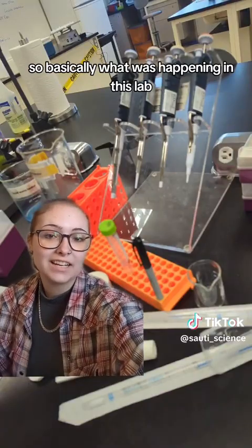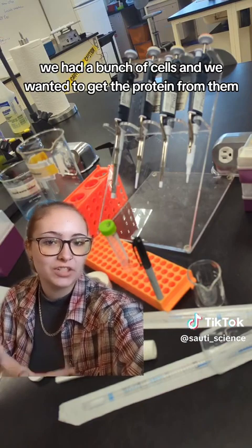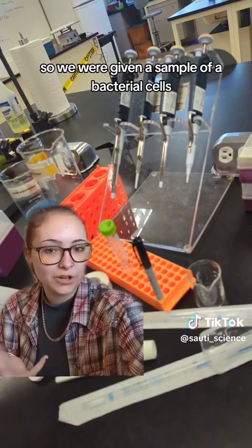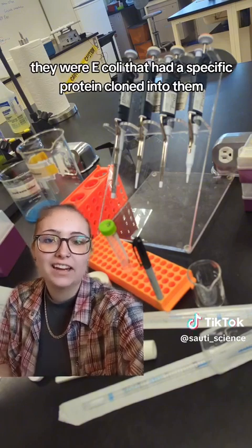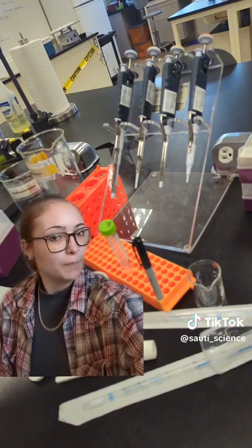Basically, what was happening in this lab: we had a bunch of cells, and we wanted to get the protein from them. We were given a sample of bacterial cells — they were E. coli — that had a specific protein cloned into them that we wanted to then extract.